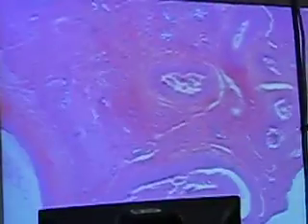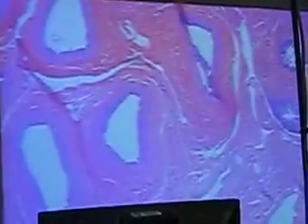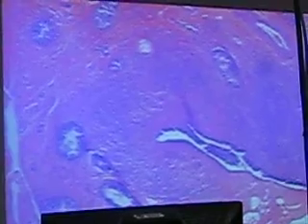And I forgot about that slide. The corpus luteum to the corpus albicans is also something that you want to take a look at. Because what happens is the Graafian follicle releases the egg, and then that follicle turns into eventually scar tissue. But before it turns into scar tissue, it's actually going to be active hormone-producing tissue. Well, let me see if I can find that.